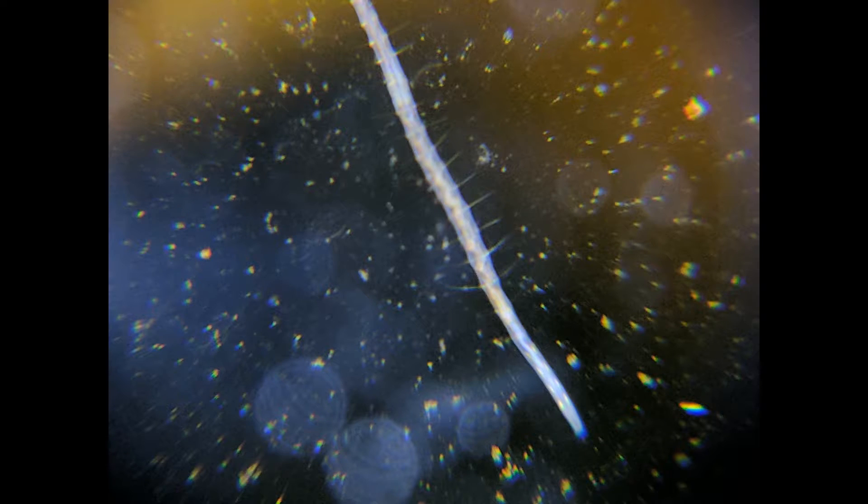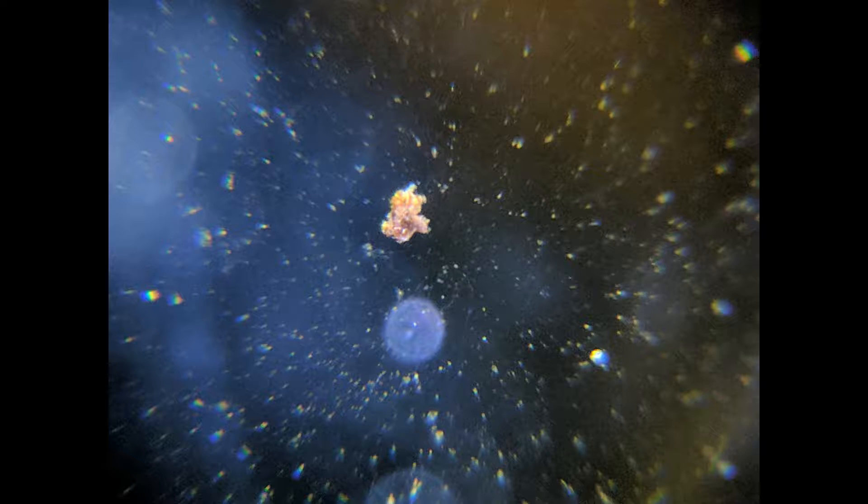I also got this little microscope to clip onto the phone because I wanted something that would be easier to use when trying to look at stuff through the glass of the tank. It works quite well — for about two pounds if you get it direct from China it's not going to be the best optical quality, but it does a fairly decent job and it does a better job than me holding it up to my little 10-pound pocket microscope against the side of the glass.